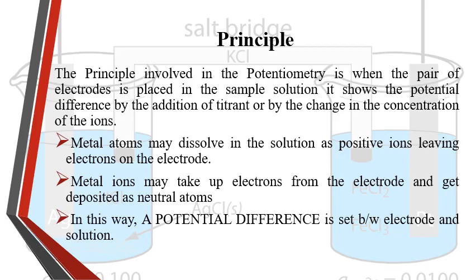Or the titrant may cause production of potential at the end point when titrant is no longer being used up by the active ingredient. The sudden increase in the titrant concentration results in a sudden increase of potential. The endpoint is determined by sudden change in potential. From the endpoint determination, the concentration of active ingredients can be measured.